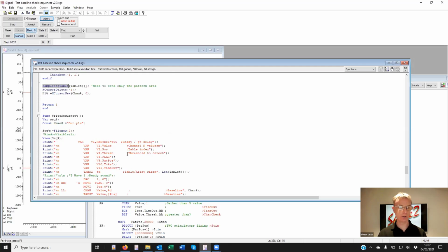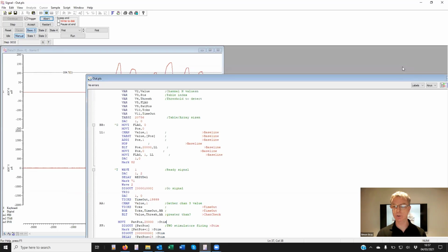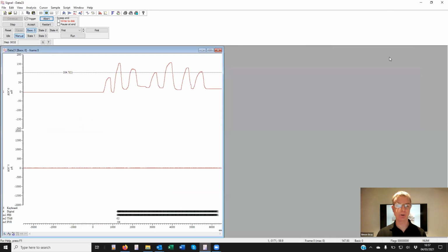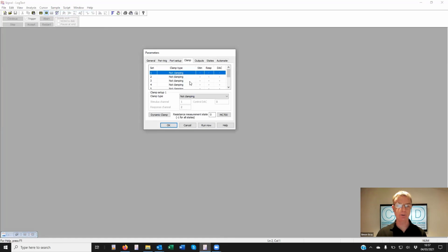Now we're a little short on time for going into dynamic clamp, which is a whole other area of advanced sampling that I was going to get onto. I should very briefly just mention that it does exist. It's something you would use in current clamp mode.